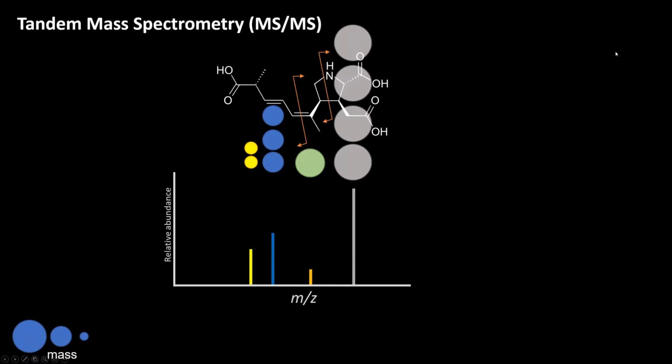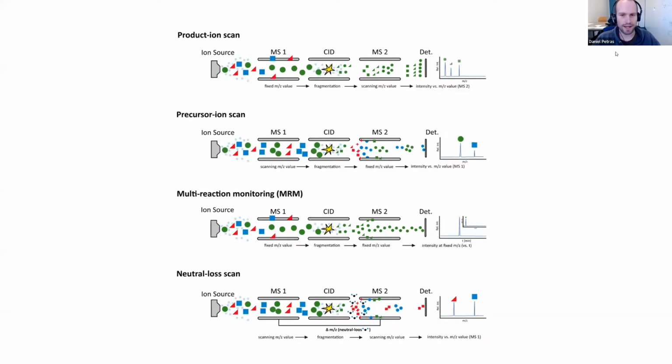Okay, so yeah, we can build up sequences from peptides by de novo sequencing, and this works very nicely because peptides typically fragment with collision-induced dissociation at the peptide bond. And it's very well understood how that behavior is. For small molecules and metabolites, sometimes it's a little bit more complicated, and establishing a de novo structure is actually really hard.